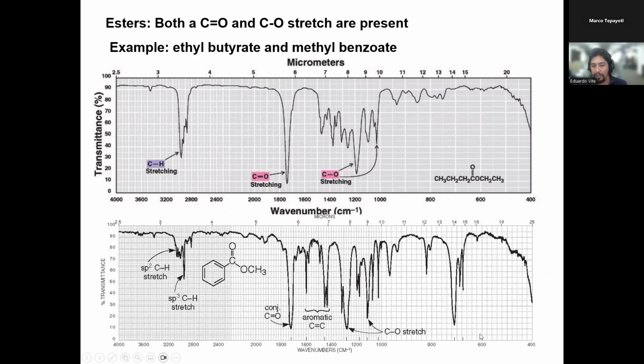And then there's one more peak here at around 700. You see it's very sharp, very strong. Again, that could be the oxygen carbon methyl stretch, that could be the carbon oxygen wiggle, that could be the bend. It's really hard to say. So again, we don't really pay much attention to the fingerprint region. If we need additional justification, we can point to something and kind of say, yeah, I think that's most likely this one. We kind of care more about the stuff above 1000.